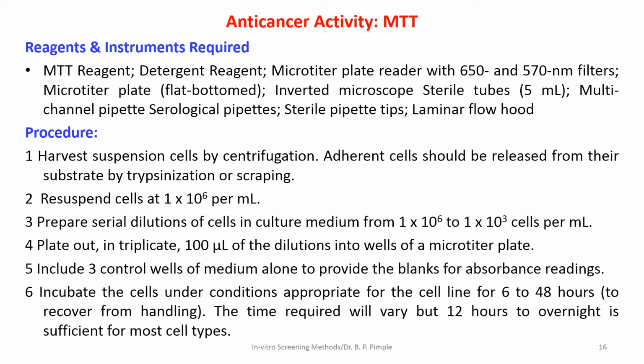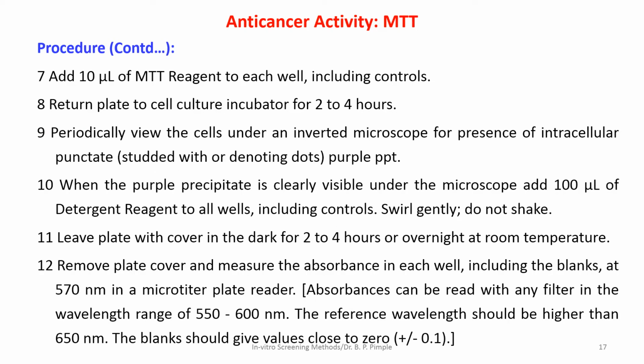Dilutions of these cells are added with culture media, and then for each of the sample, minimum three wells are prepared. Like for control, three wells; for test one, three; test two; test three. And even for standard also, we need to prepare minimum three wells. They are incubated. Then the reagent, that is MTT, is added in each of these wells. Later, the plate is maintained in an incubator for 2 to 4 hours.